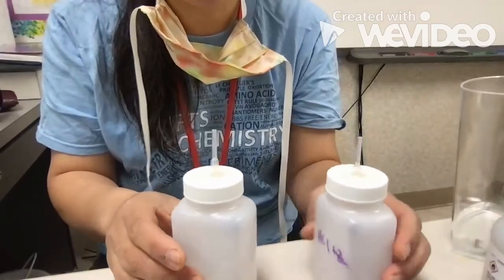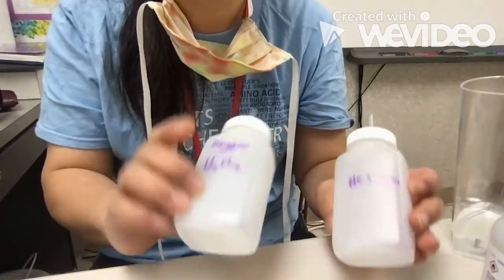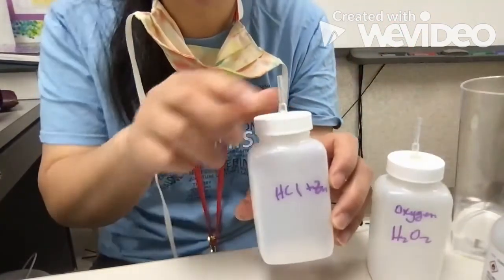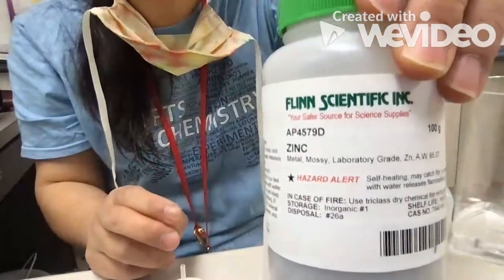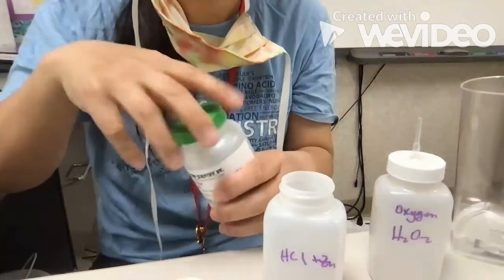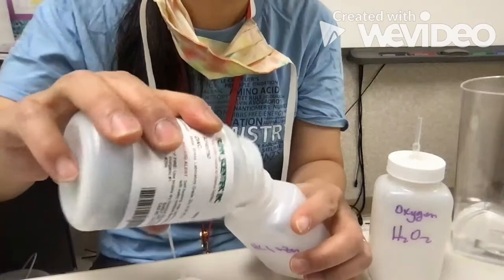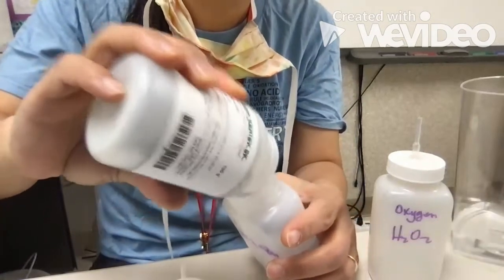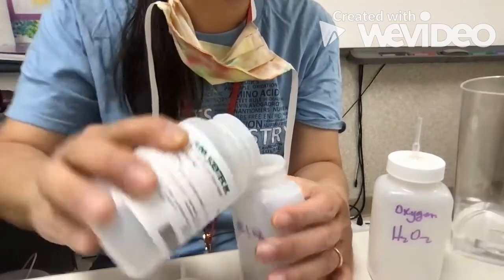Okay, next step is to generate hydrogen and oxygen. So here's your hydrogen generator. You're going to put in the bottom of this some mossy zinc, which I'll have in the front. And you want to take about 4 to 5 pieces to start with. You may have to add more.